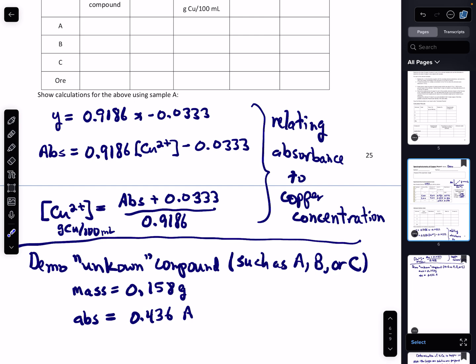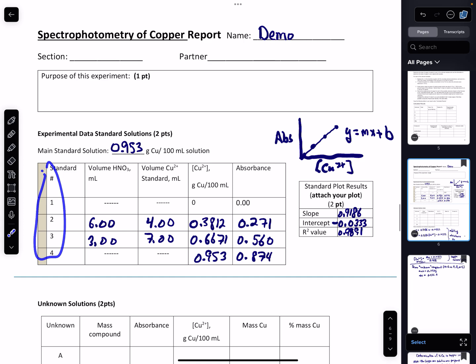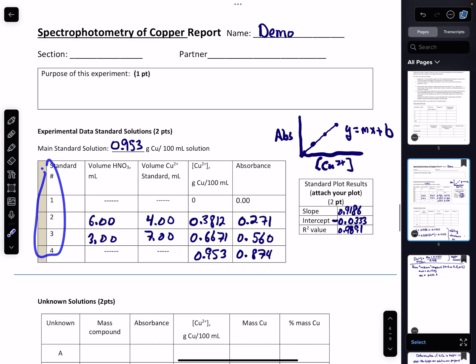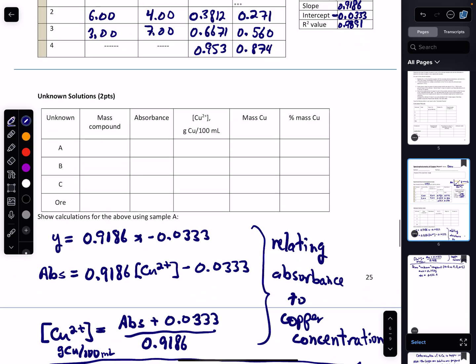And that means that once we have created this standard curve and are using the spectrometer in real time, the same time we've made those measurements of those standards, we can measure the absorbance of any other solution. And effectively what we're doing is we're saying, if you measure the absorbance, it's a different color here, you can go over to the line and go down there and figure out what the copper concentration is. But we're doing that not just on the graph, we're doing it numerically using the equation for the line.